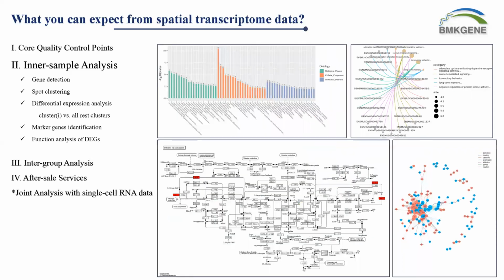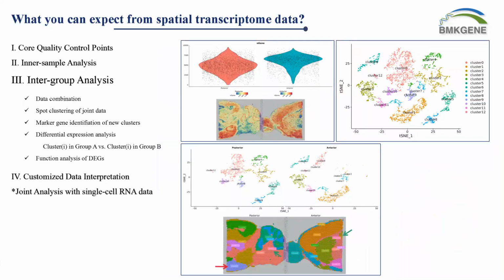So, yeah. And once we identify the genes, for sure, the next thing we want to do is to know the biological meaning of these different genes. These are the very typical studies that we would do, like GO enrichment, protein-protein interaction network, and KEGG pathway analysis, etc. These help give a biological meaning to what we have identified from the comparison.